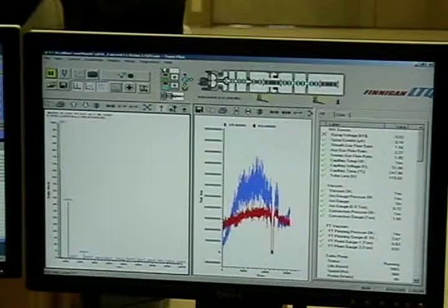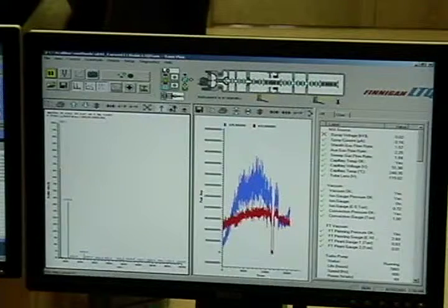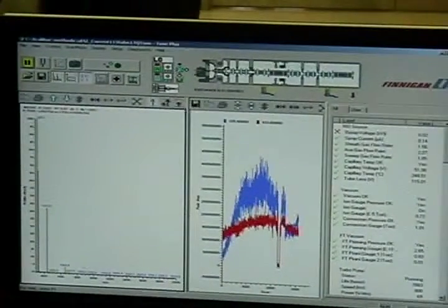Typically at 150 volts you get 1,000 to 1 on the ion trap. FT I think is like 400 to 1. It's hard to measure noise in an FT, because we remove all the noise. The other experiment that would be interesting to run is with lower resolution, to see how many phosphorylation sites we discover.